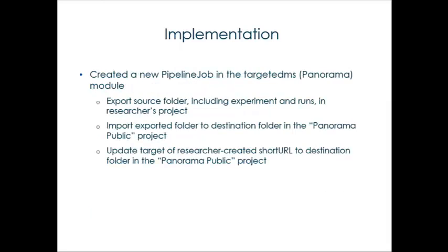And finally, with all of that in place, we created a new pipeline job in the Panorama module that exports the folder, including the runs, experiments, basically everything about the folder, and then we import it to the destination folder on Panorama Public. Then we update the target of the researcher-created URL to point to this new location on Panorama Public. And that's how things work.